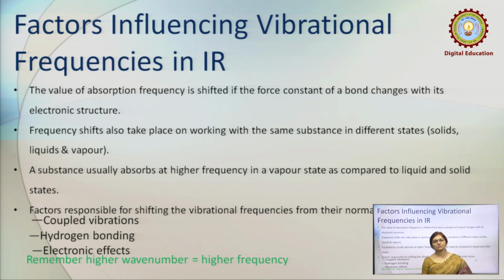A substance usually absorbs at higher frequency in vapor state as compared to liquid and solid states. The following factors are responsible for shifting the vibrational frequency from their normal values: coupled vibration, hydrogen bonding and electronic effect.